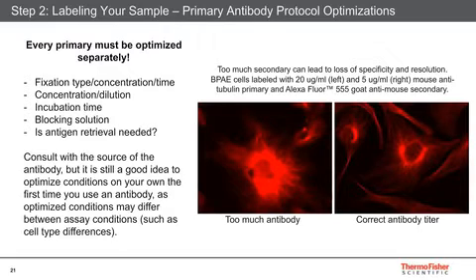Often there's recommendations from your commercial source, but you want to test it on your own. Don't just go with what they recommend because every assay is different, every sample is different. And though we validate our antibodies carefully, we can't always predict what your sample will need. And finally, a blocking solution too. I mentioned different blocking solutions. Not every block is the same for every antibody.